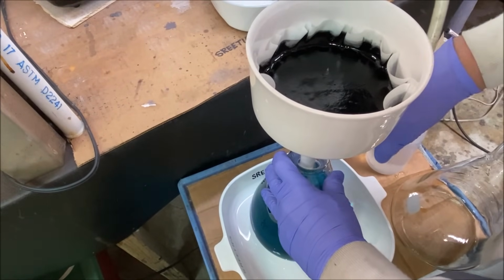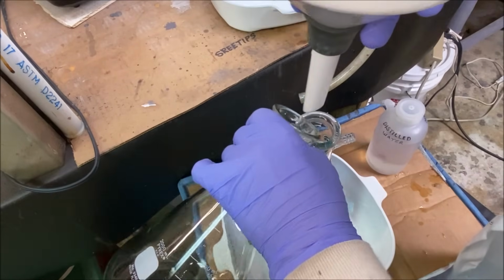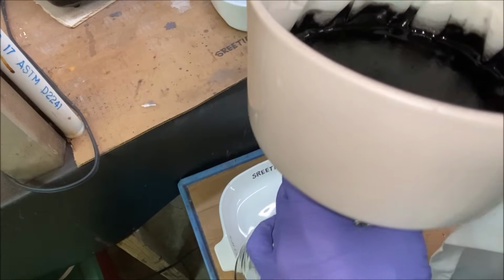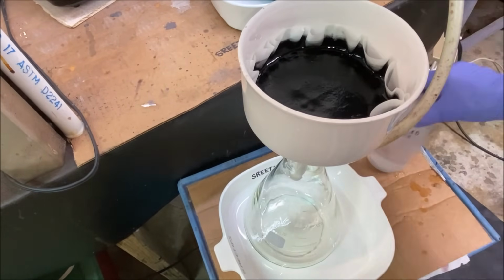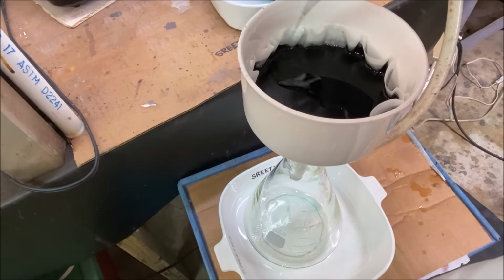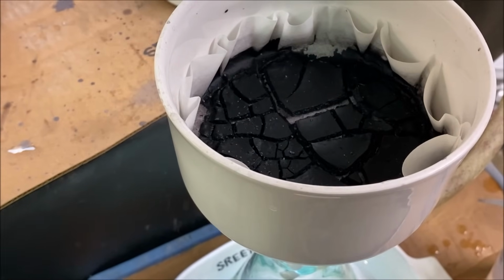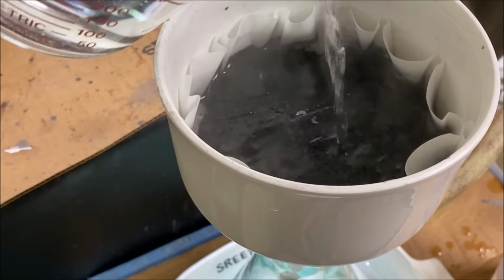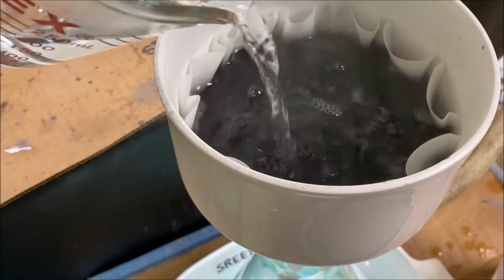So what I'm going to do is put this funnel on a new flask, and get this out of the way. And now what we'll do is start rinsing these black solids. This looks promising. I've rinsed it many times with some distilled water. Now I've got some hot distilled water. Rinsed it a couple times with this hot distilled water.